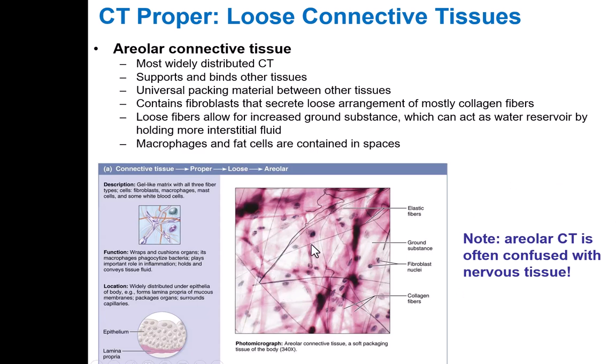Those are nuclei of cells, but you see other things too. It's not like an epithelial tissue where all you see are cells packed together. There's space in between the cells here, and you see these long, fiber-looking things in this particular connective tissue. This is a clue that you are looking at a connective tissue. Now the question is, which one are you looking at?